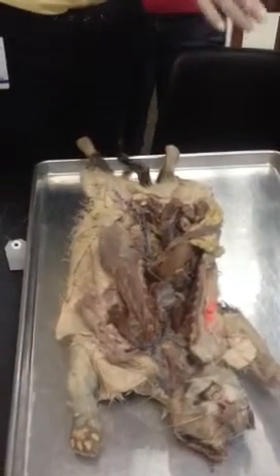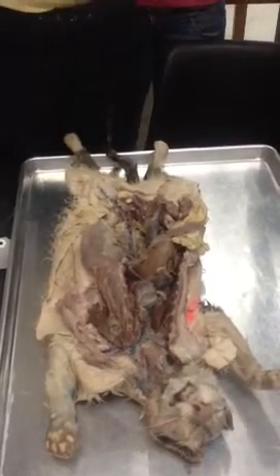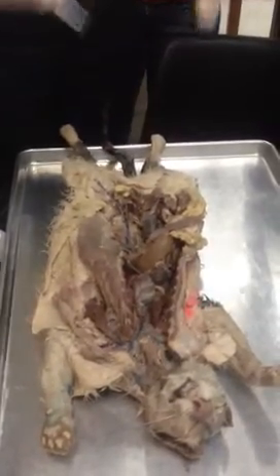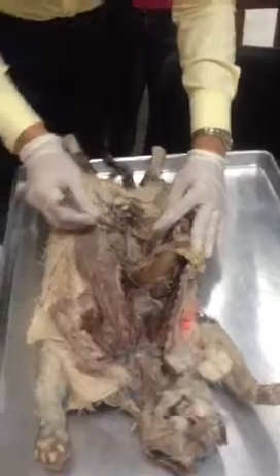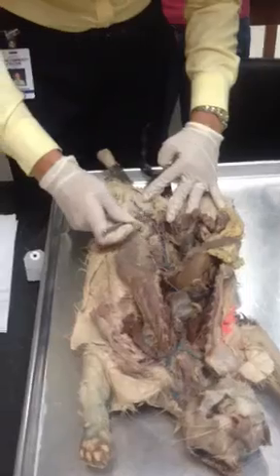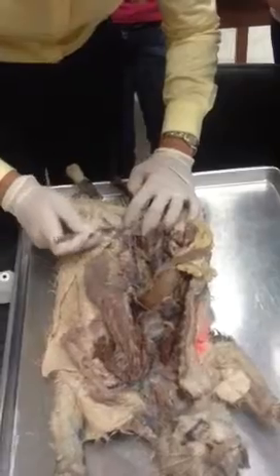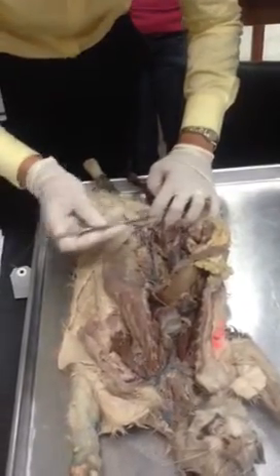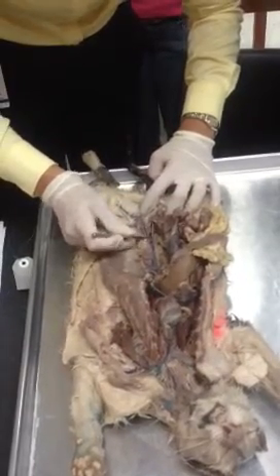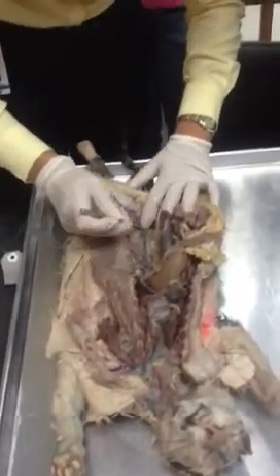And when we go back, and again, I have a tendency to go against the flow. But when you are studying veins, try to go with the flow of the blood, right? The way from the venules and veins as they are merging together into the larger and larger. Would we see this very obvious one? That would be inferior vena cava, right? And again, here we have the femoral vein. Femoral vein comes into the common iliac, not common, the external iliac, I'm sorry, I'm confused with the human, external iliac, and then yields into the inferior vena cava.